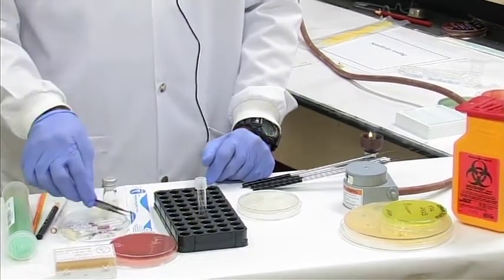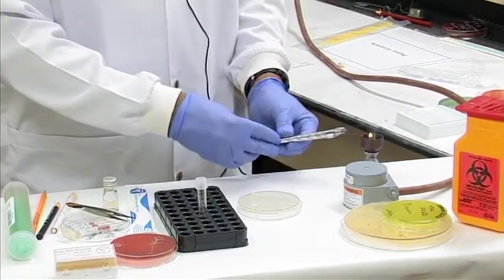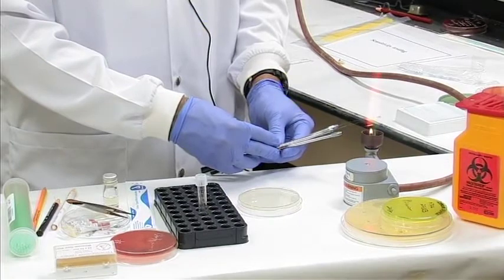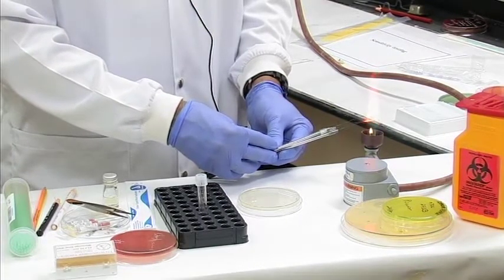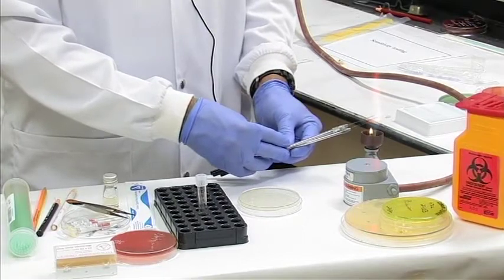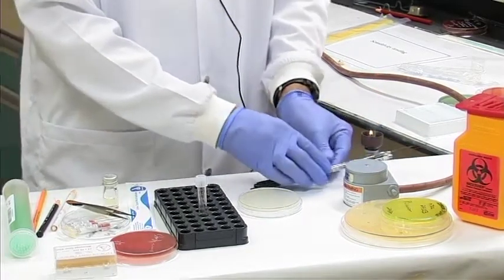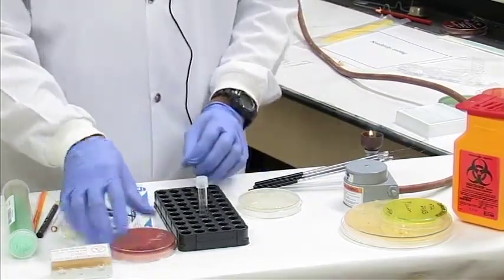So to do that, you will normally take a flame-cooled loop, which you'll use to pick up your bacteria. Now you'll need around 2 to 5 colonies of bacterial growth to perform your AST testing. So we have our bacteria here.